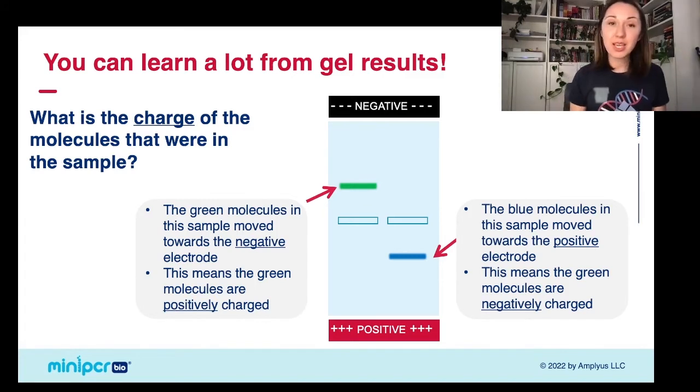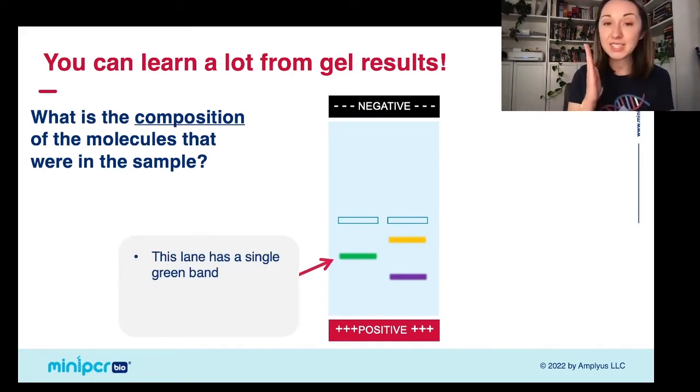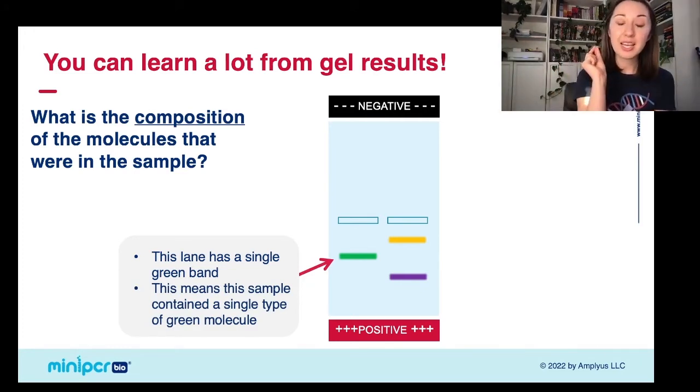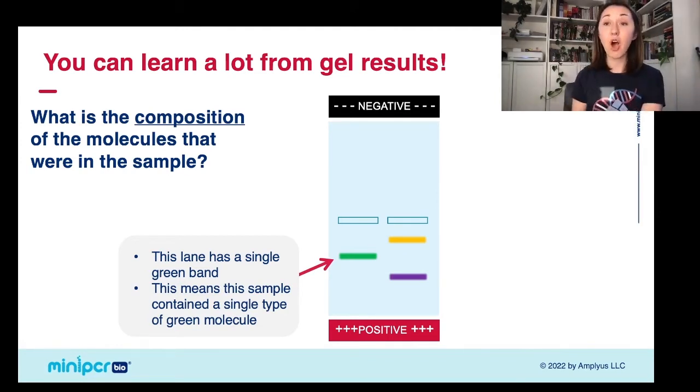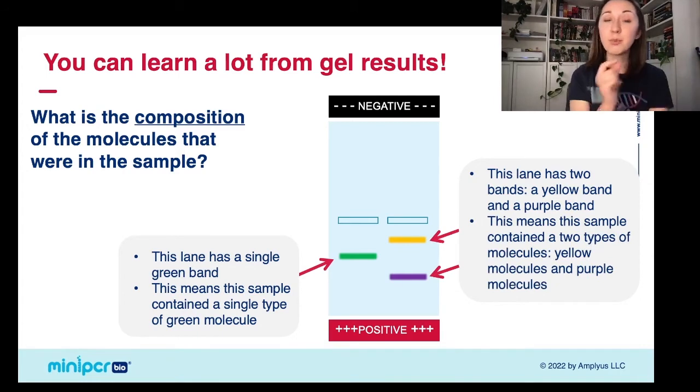The other thing we're going to be able to tell really quickly is the composition of the molecules in that sample. So here we have two examples. So in our left lane, we have a single green band. And so that means that there was only one type of molecule, only one type of dye in that tube that we had. So it was composed of only a single type of molecule. On the right, we have two bands in that lane, a yellow band and a purple band. And so this means that our original sample that we put in the well was composed of two types of molecules, a yellow one and a purple one.